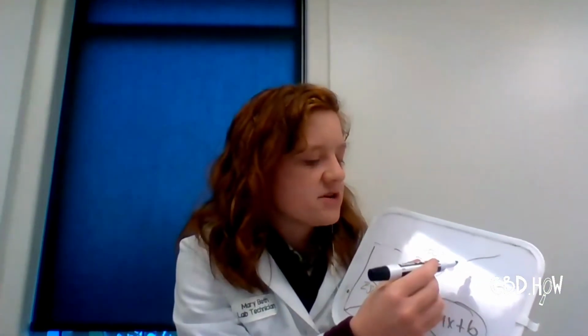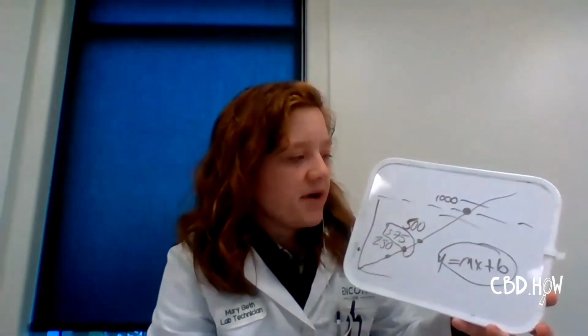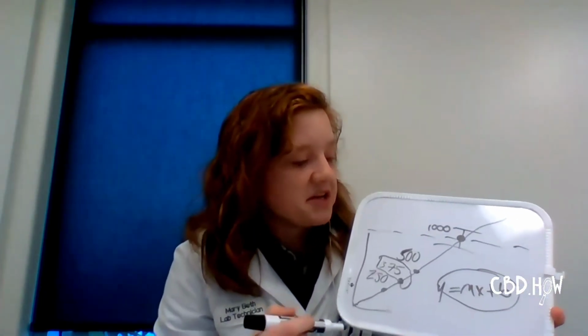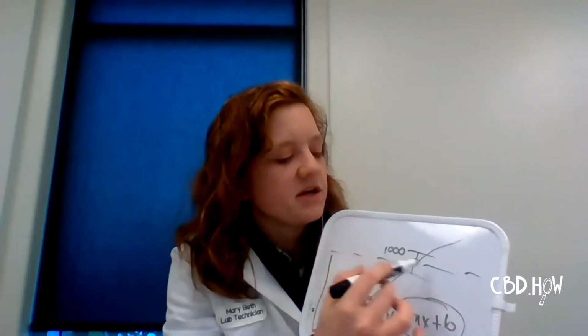We have a lot of quality checks built in that the BCC regulates. Every day we have to inject a standard so that we can prove our instrument is within a range of accuracy. We tell the instrument, okay, this is supposed to be this concentration, and it has to be within a certain window for us to say that the instrument has been properly calibrated.